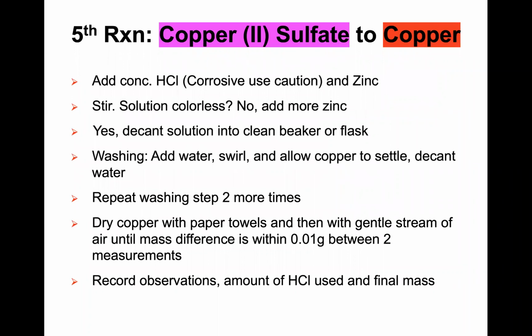In order to make this reaction go faster, you will add some concentrated hydrochloric acid. Think about the purpose of that: we use zinc, right? Normally zinc is very reactive, so the surface oxidizes to zinc oxide, and zinc oxide will protect the zinc.